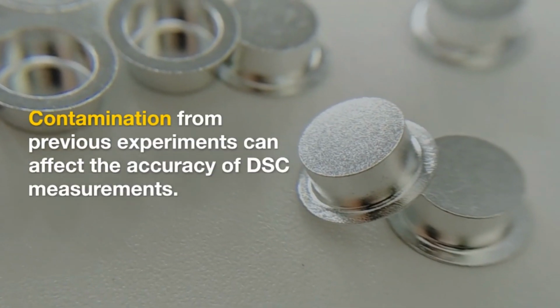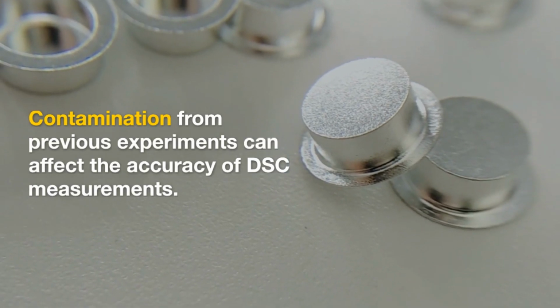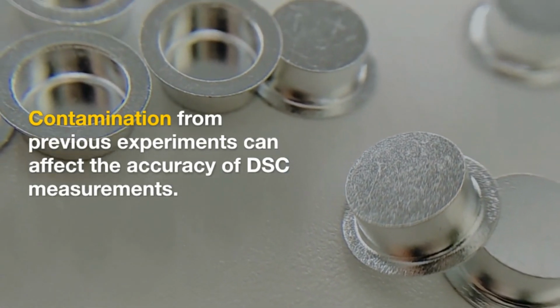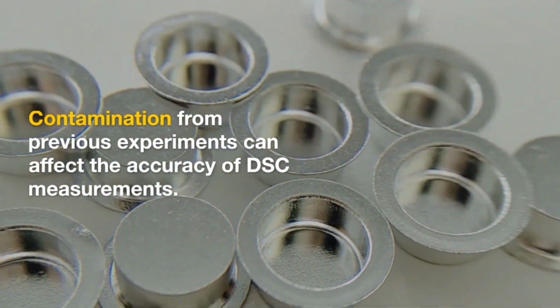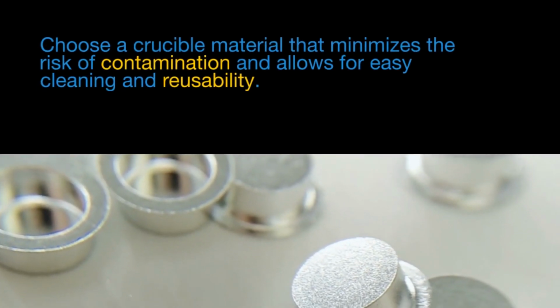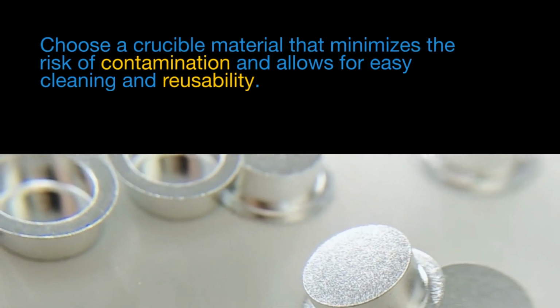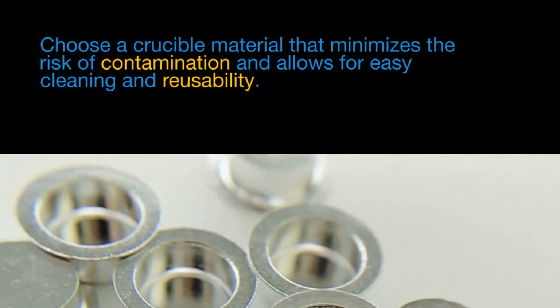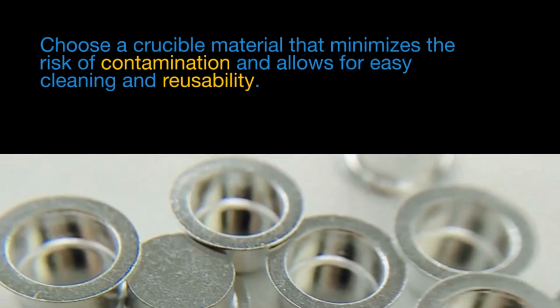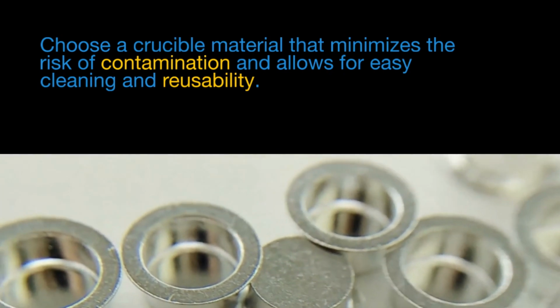Last, contamination and reusability. Contamination from previous experiments can affect the accuracy of DSC measurements. Choose a crucible material that minimizes the risk of contamination and allows for easy cleaning and reusability. Some materials may require specialized cleaning procedures or disposable crucibles for certain applications.